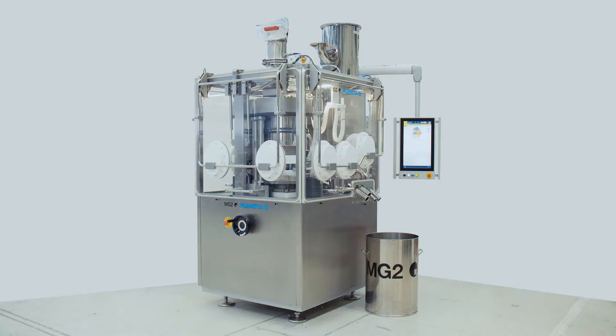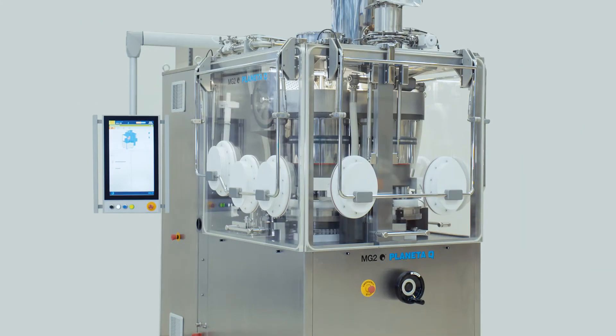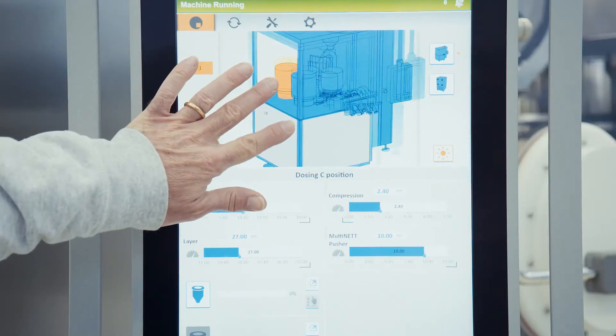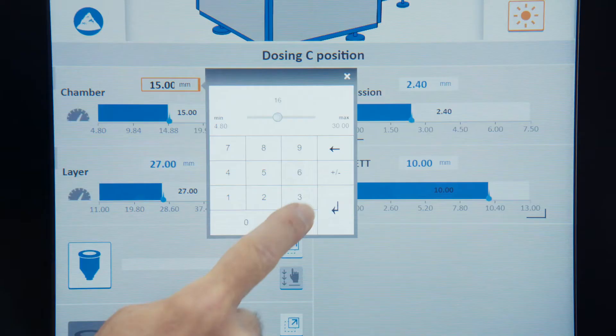The operator panel is a B&R 21 inch touchscreen and it can be rotated around the machine. MapView allows intuitive programming and the interface is easy to use and efficient.